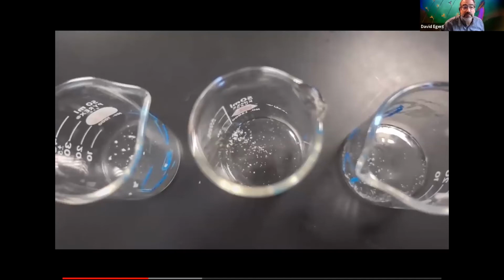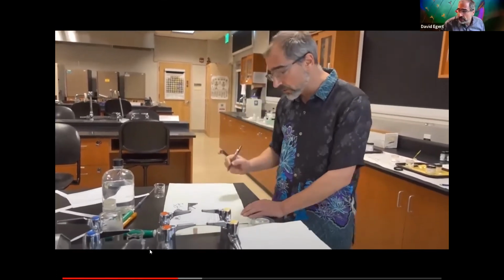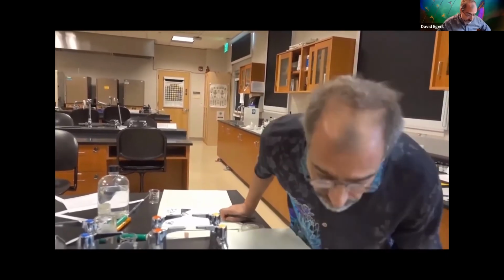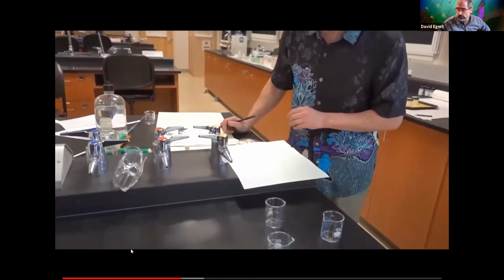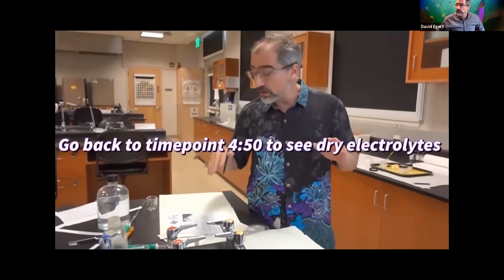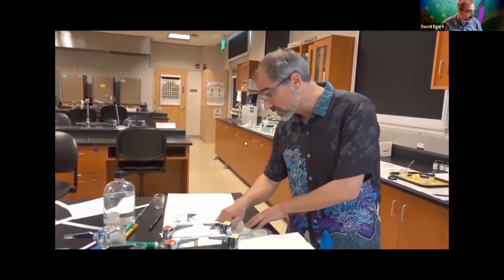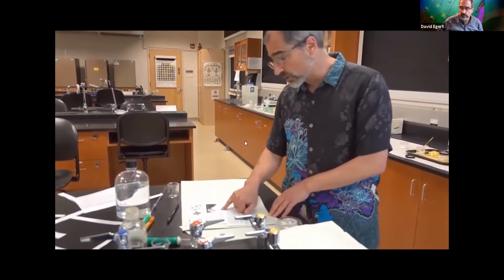All right. So the next step was to add water to these puppies. After I've done that, I would write down again, like KCl, white fine grains, etc. I'm not going to spend all the time doing it right now, but you would if you were here. Then I'm going to add water. It says add 5 mils of distilled water to each beaker, and then swirl the contents.